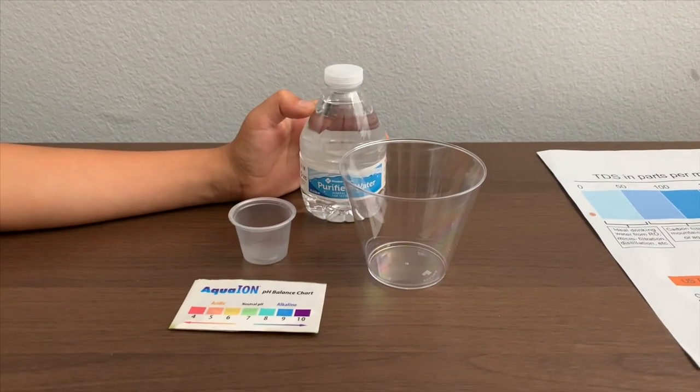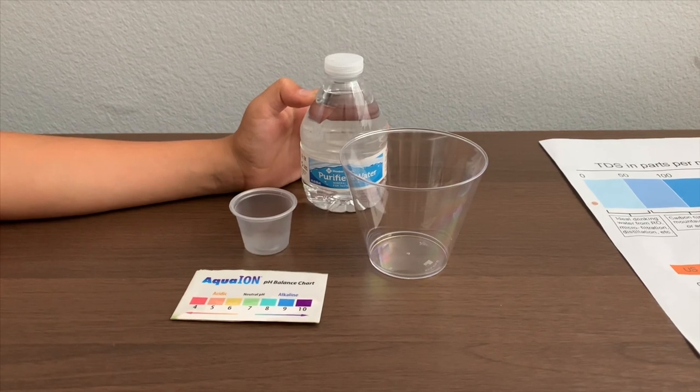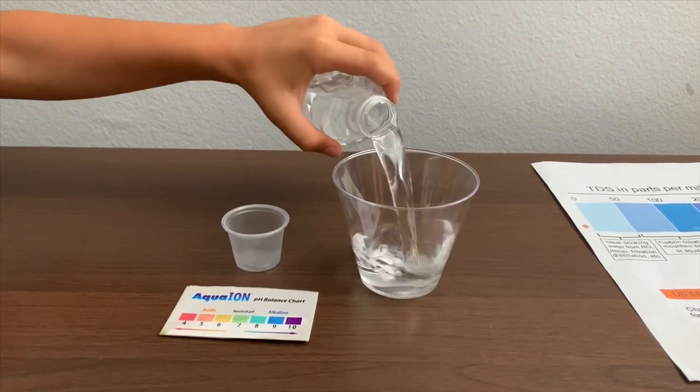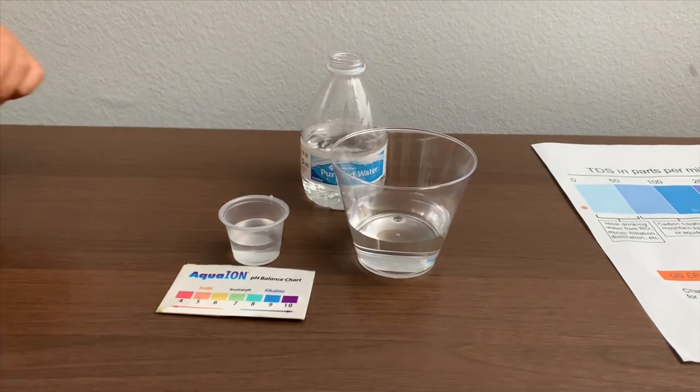This is Memories Mark Purified Water, and it has minerals added for taste. Let's test the pH and TDS levels. Let's pour some water in. First, let's test the TDS level.